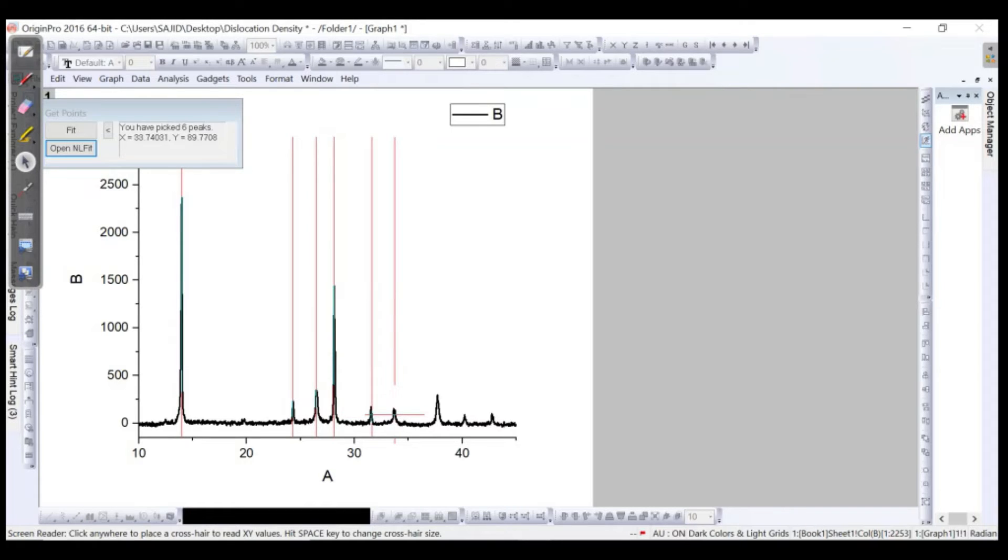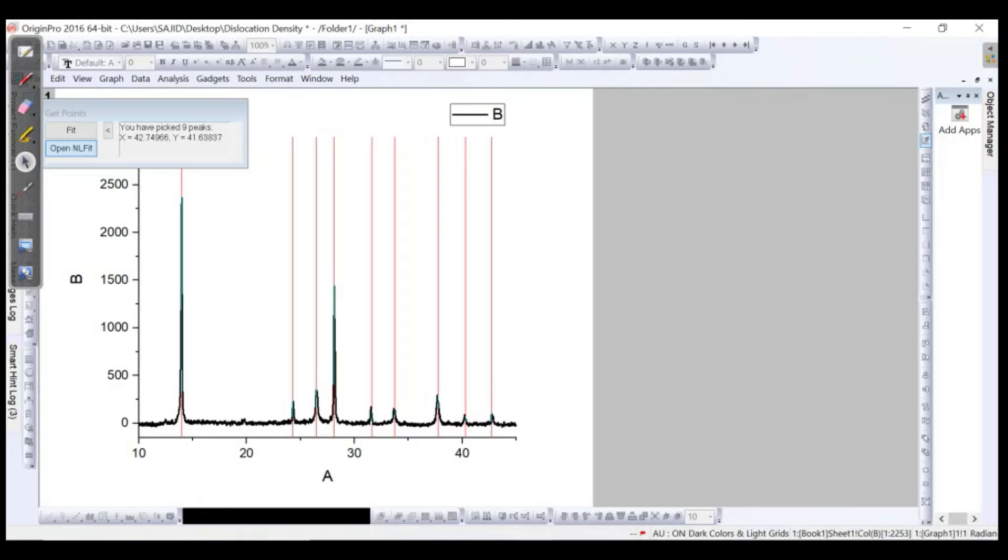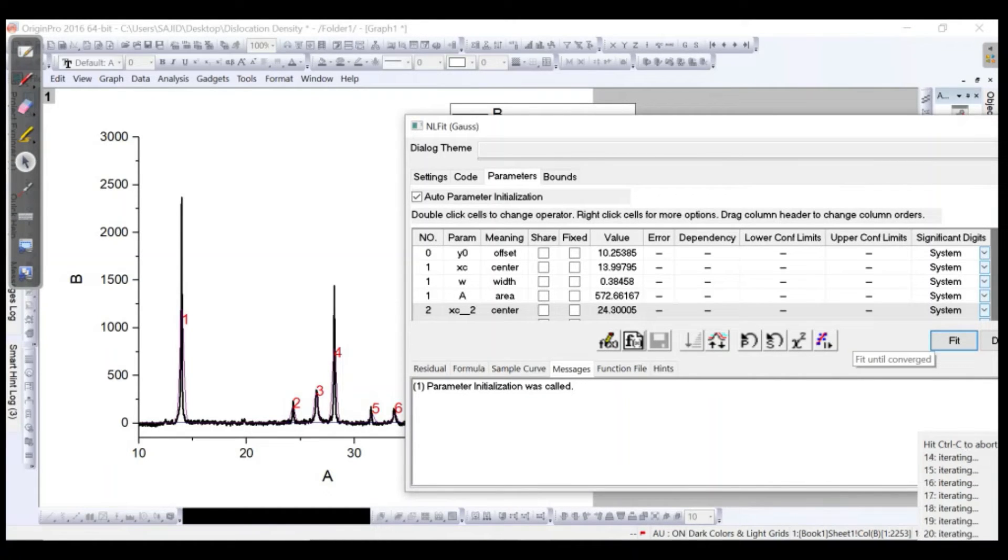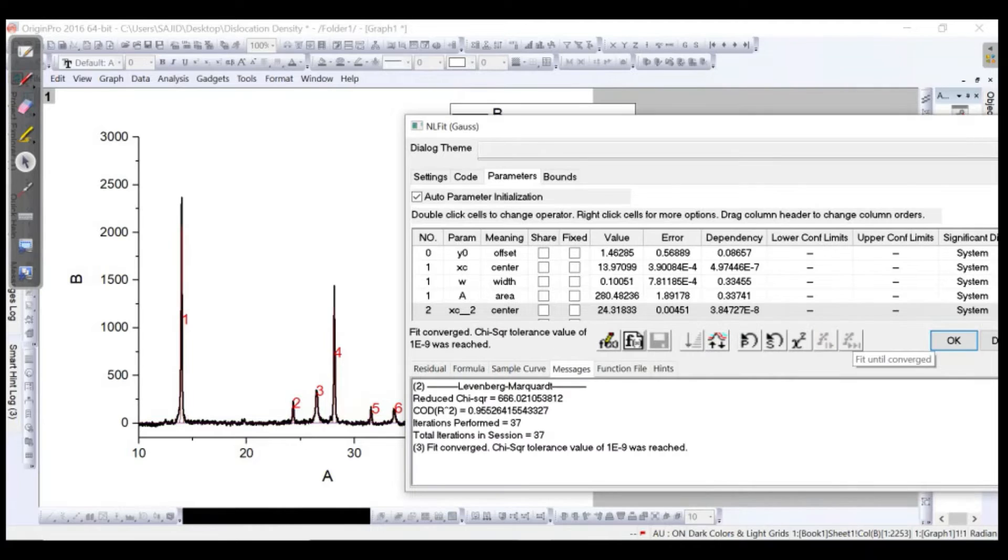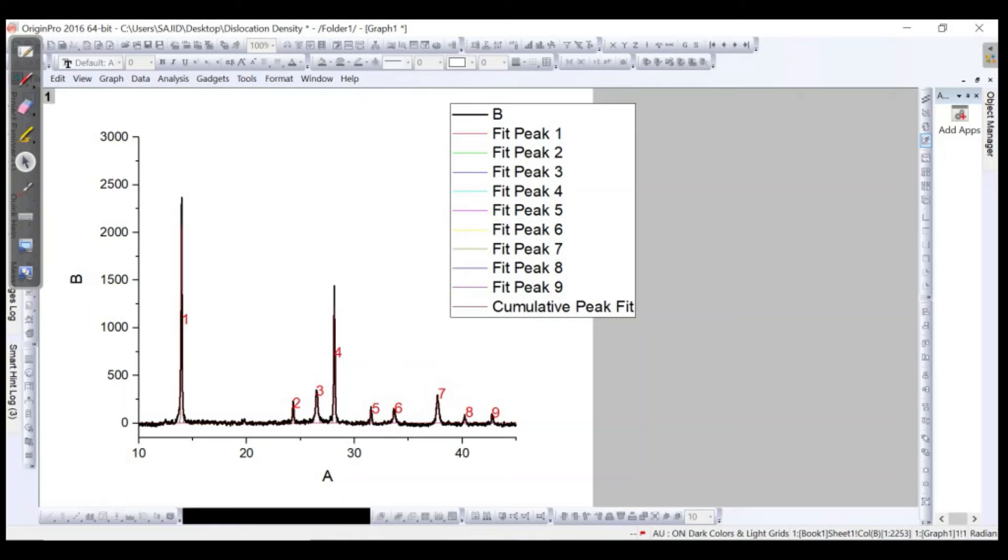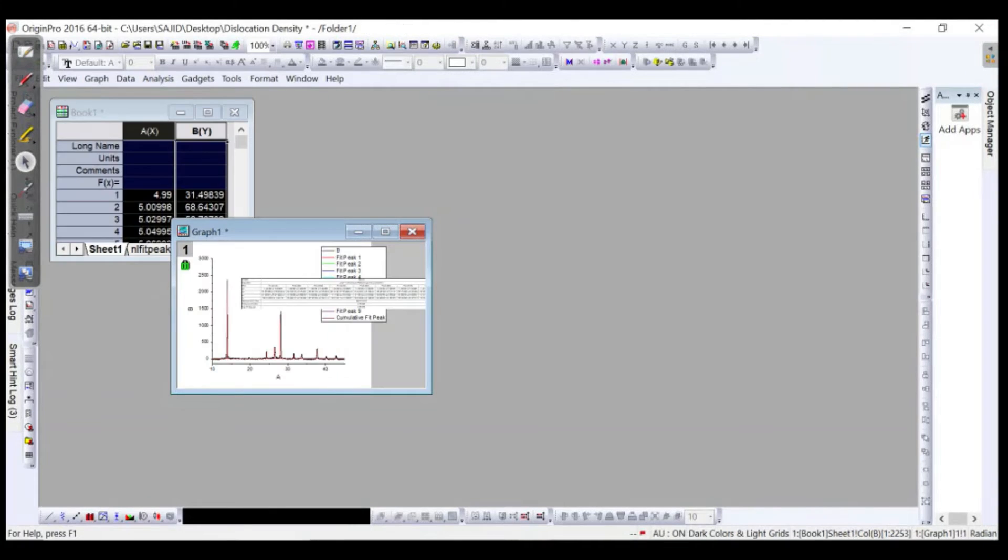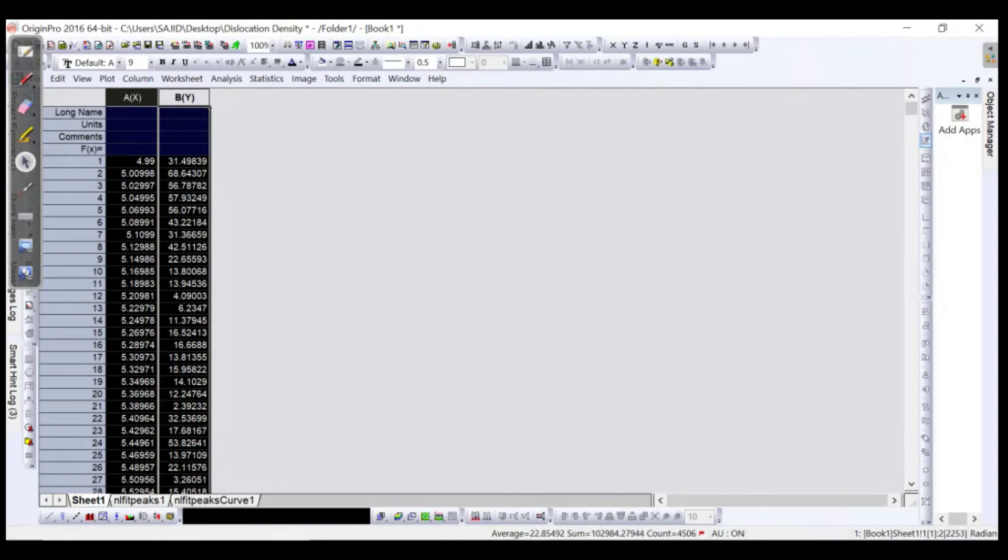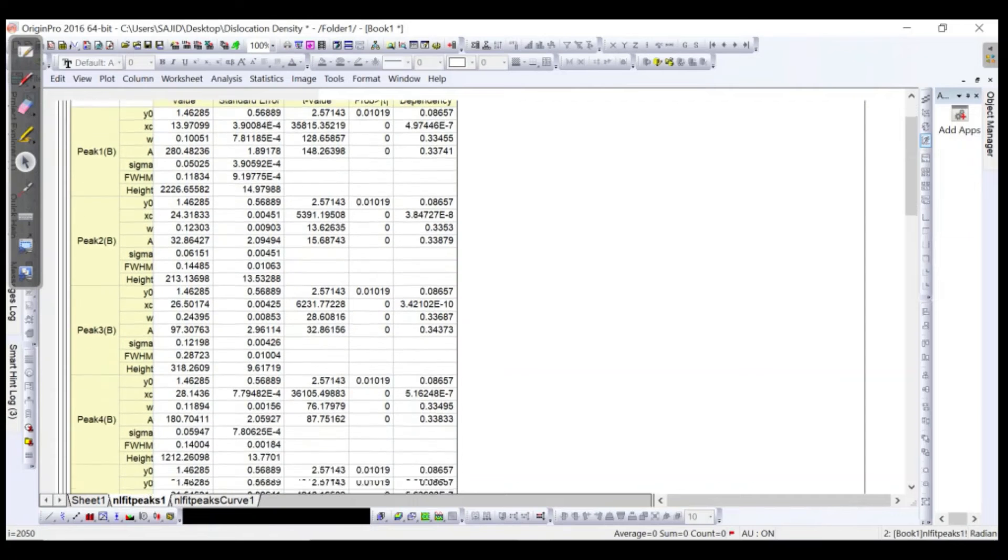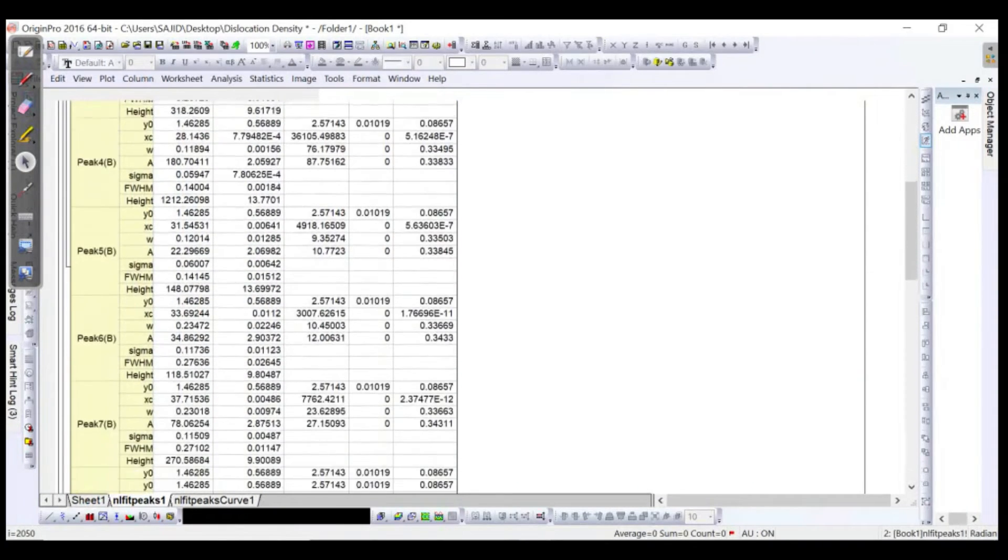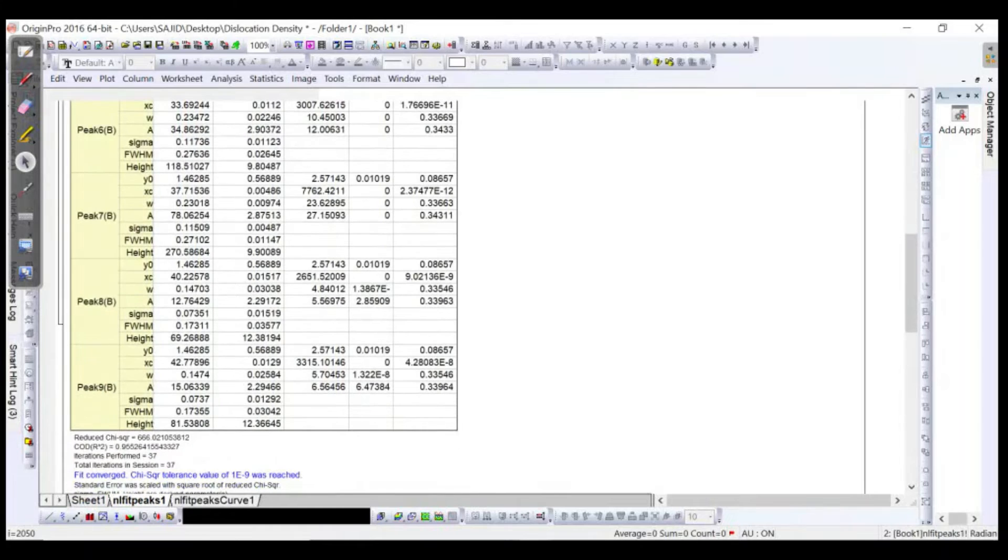Let me do it carefully. Now click on the fit until converge. Okay, now let's see, done. We will have a table over here. Let's see what we have. Minimize it, go to the table. Here we have the table where we can find out the position of the peaks with respect to the degrees or angle.